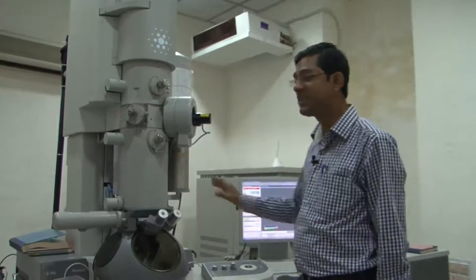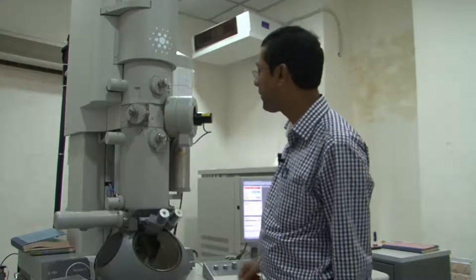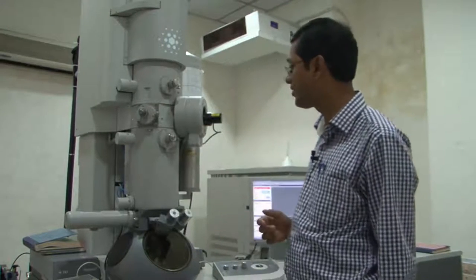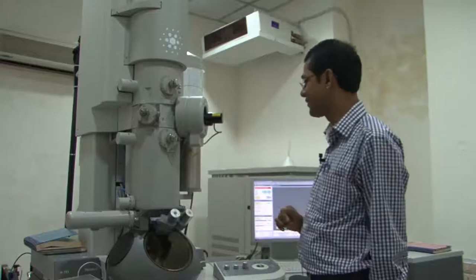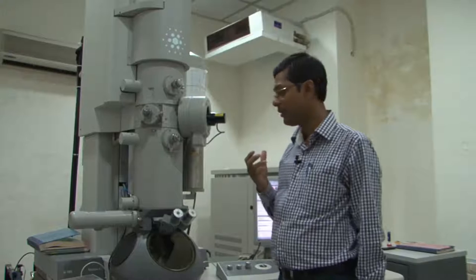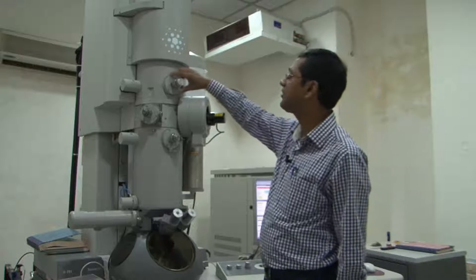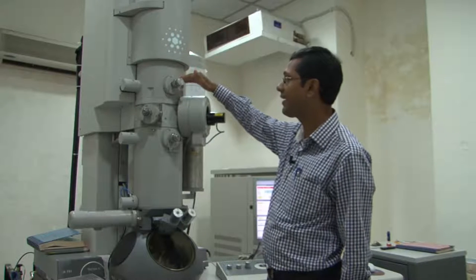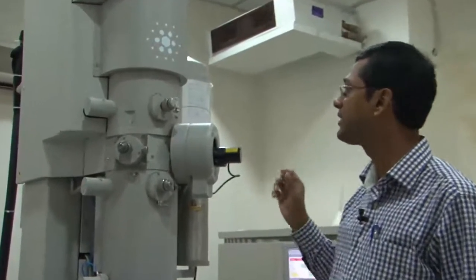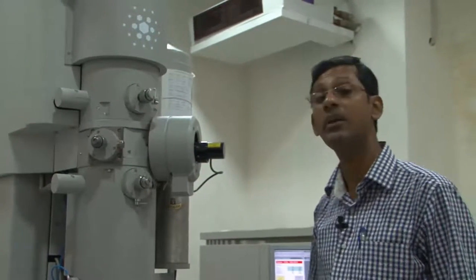In this microscope, which is basically a dedicated high resolution microscope, you have the objective lens which is separately cooled, so that the temperature of the objective lens cannot increase so much that the focal length changes. Other than these lenses, we have apertures. Apertures are basically used to select a particular beam, or basically to dictate the size of the beam. We have an aperture here just below the first condenser lens, which can make the spot size very precisely. So one can change this aperture and set it at different levels depending on the intensity level you want.